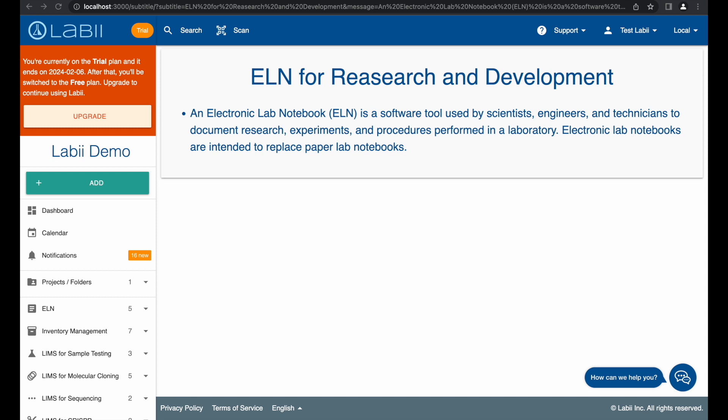At Labii, we developed the notes function to make it easy for researchers and developers to quickly document what they worked on each day. With this feature, you can easily create quick notes and fulfill all of your research and development needs.